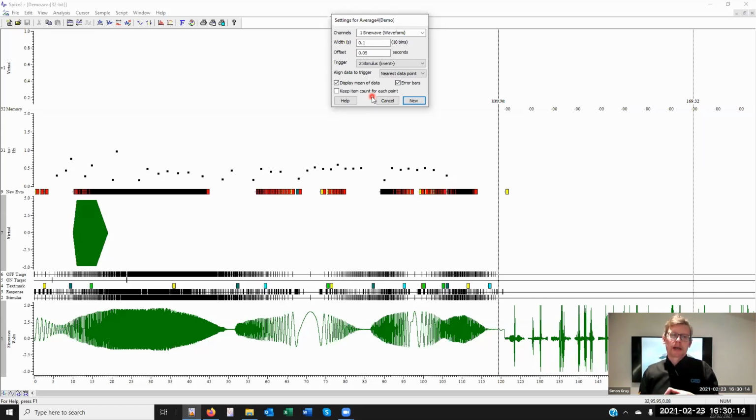So you can imagine we have, say, always data in the pre-trigger area. Therefore, we've got the same count for all of the bins in the result view. To the right, past 0, we may not have data in some sweeps, so we get a 0 count for that particular sweep. So the point is, the average could be filled with data sections of different lengths up to the maximum width that we have here.